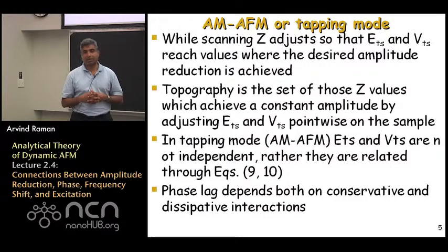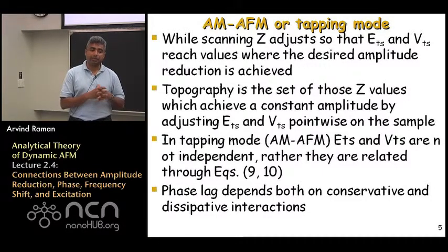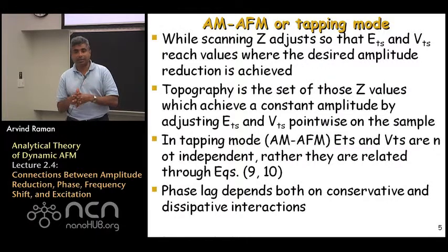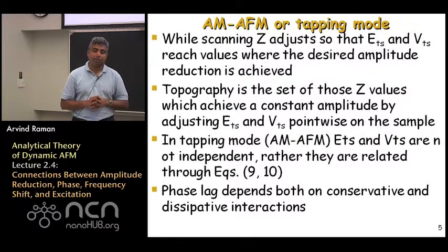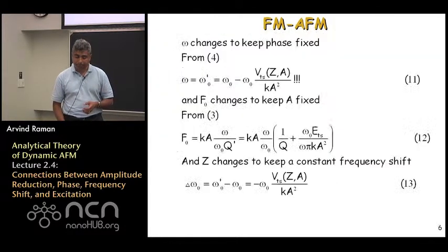The last important thing that emerges from this is that the phase lag equation depends on both ETS and VTS. We're going to talk about phase lag in the next lecture in some detail, but the key point is that both these properties conspire to influence the final value of the phase lag.